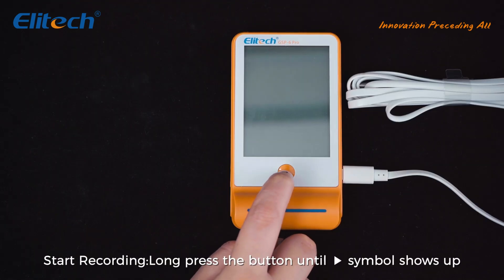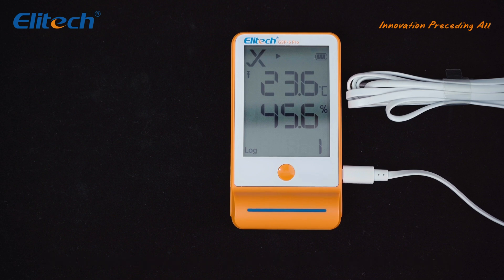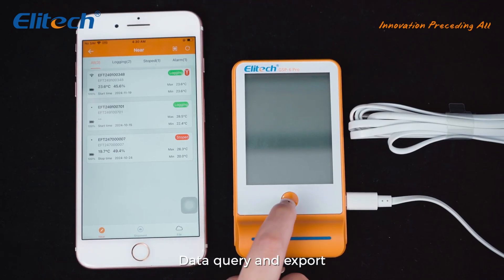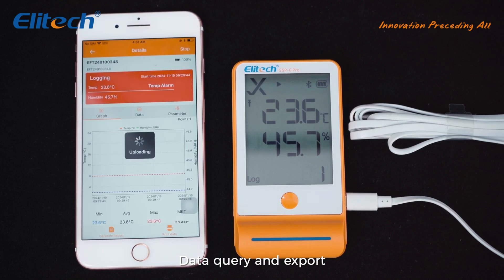Once the device is configured, press the button for 5 seconds to initiate the recording. The screen will display a triangle symbol to indicate the start of the recording. During or after recording, you can view and export the data at any time through the app.